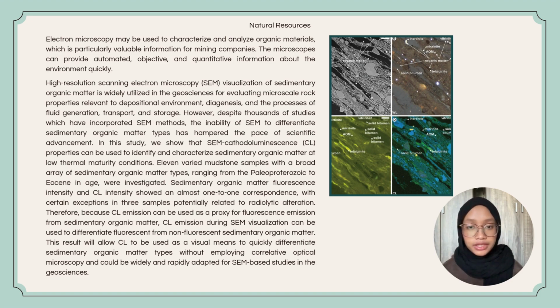However, despite thousands of studies which have incorporated SEM methods, the inability of SEM to differentiate sedimentary organic matter types has hampered the pace of scientific advancement.